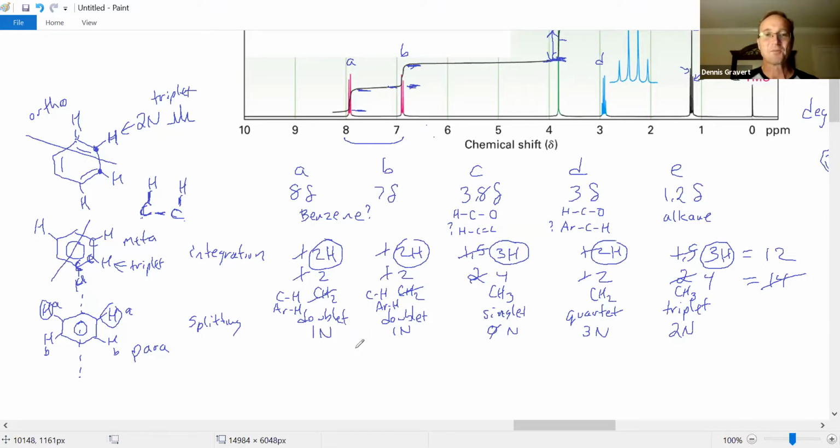Okay, so based on this data, we have come to the conclusion that hydrogens are up here. And I'm going to say, let's say this. I don't know. Maybe this one. I'm going to put the electronegative oxygens over here because closer electronegative, if I got oxygens in the molecule from the chemical formula, it's going to shift them downfield. And B, it's got to be farther from the oxygen. So I'll try not to put oxygens on this side. This carbon and that carbon need a bond each.